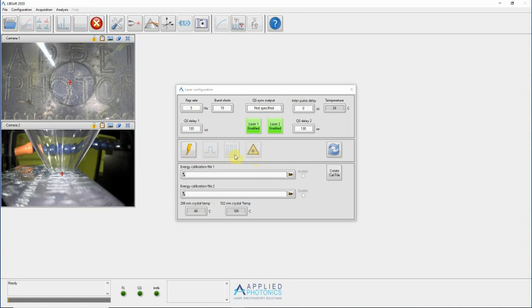The manual laser controls are just the same as for all other lasers and are displayed in the central region of the laser configuration window. As will be shown shortly, the Bernoulli laser can be configured to use either of the 2 lasers of which it is comprised, or both of them together. The manual controls will therefore operate whichever of the lasers is enabled, or both together if both lasers are enabled.